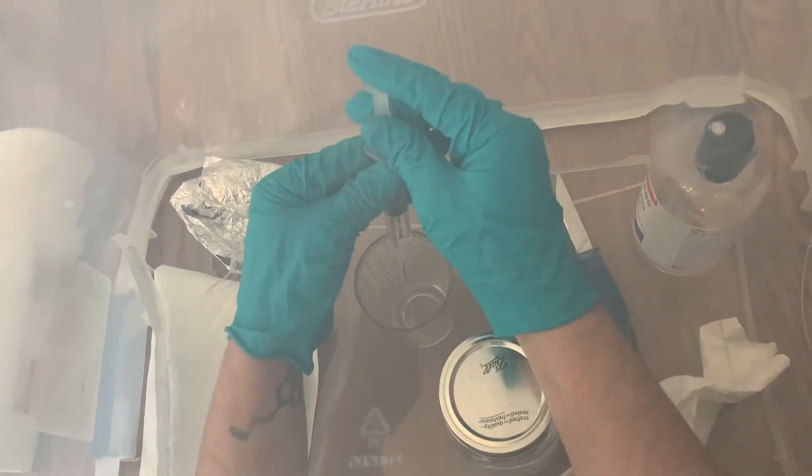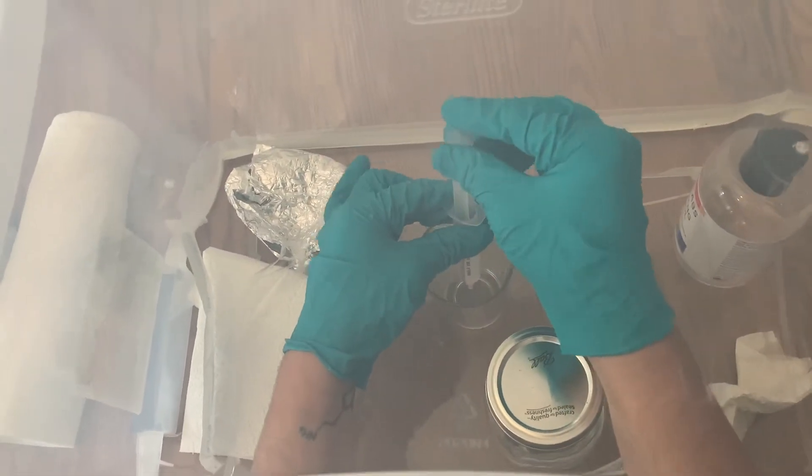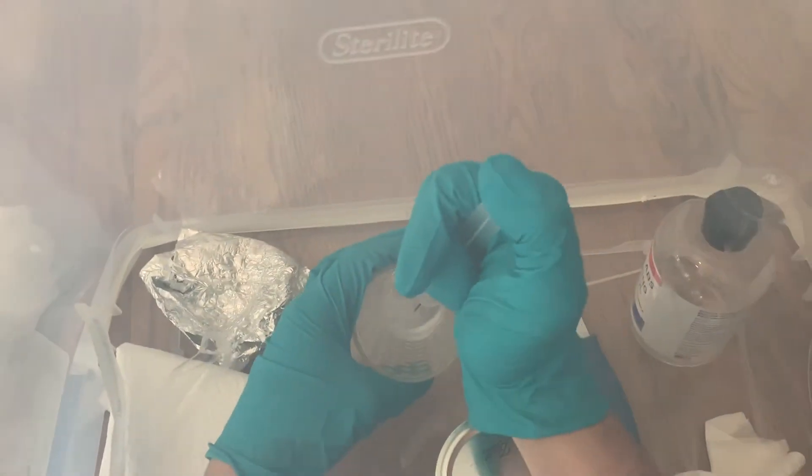The final step is to spray the sterile water into the shot glass of spores, and then suck it up and spray it out. If you do that a few times it helps mix up the solution.